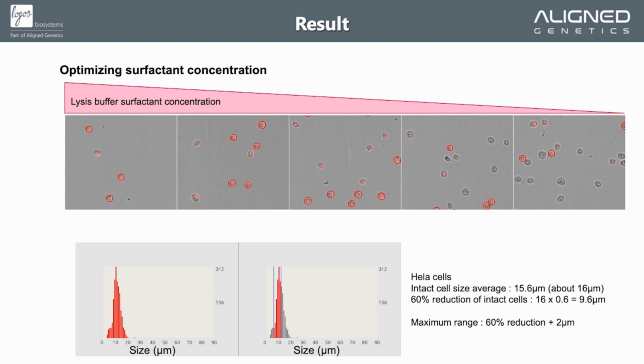To address this, use the size histogram. After completing your data analysis with your sample, you will receive size histograms within your results. Based on size, you can disregard nuclei with remaining cytoplasm or irregularly shaped nuclei, which should be either larger or smaller than your average sized nuclei. And then you can compare your analyzed images after adjusting your size range, and you can decide whether your image is good to go or not.